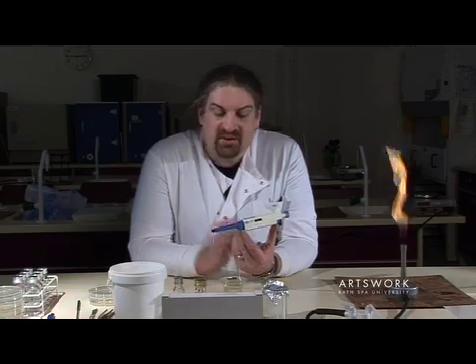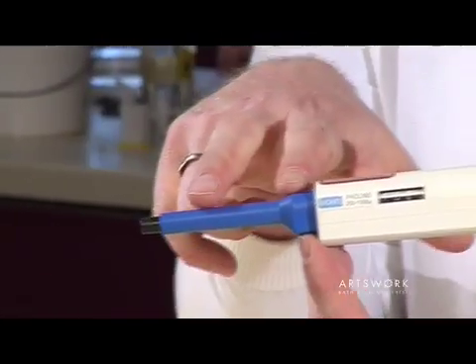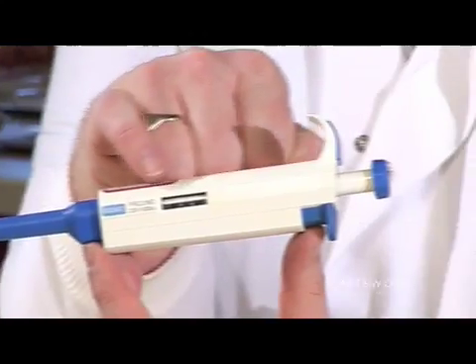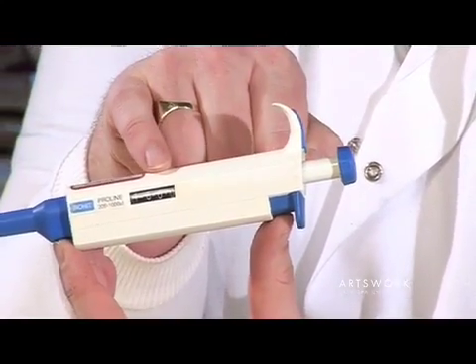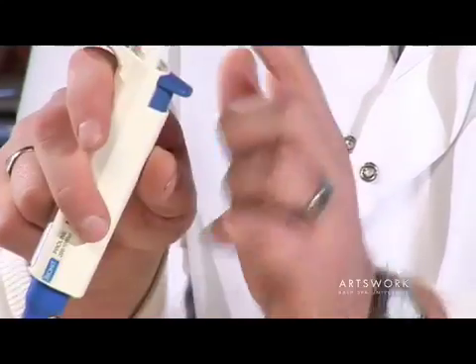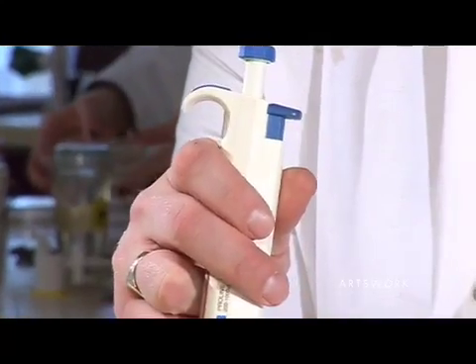The pipette itself has the end where your sterile tip goes, the barrel, and the main body where we can set the volume that we're going to transfer. Then you've got the plunger at the top, which we use to pick up and dispense our sample, and the tip ejector towards the back.